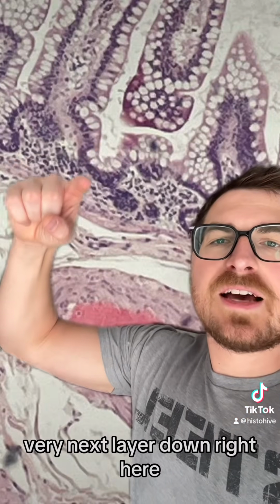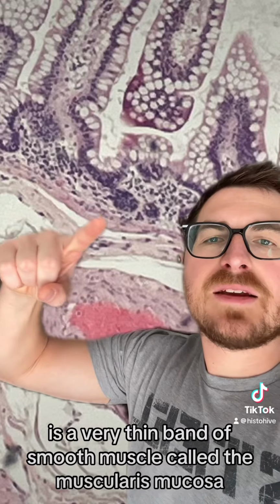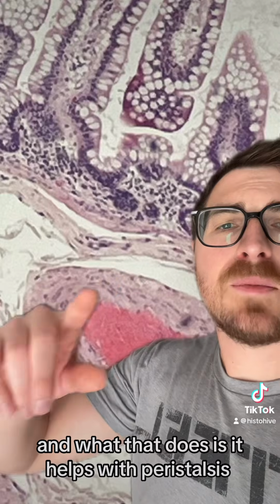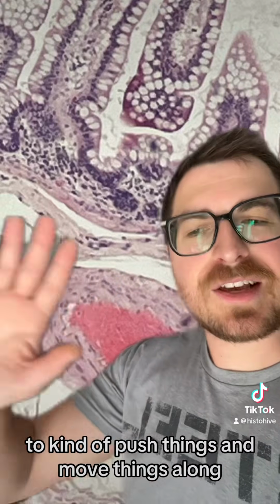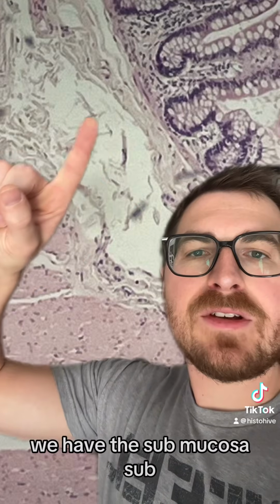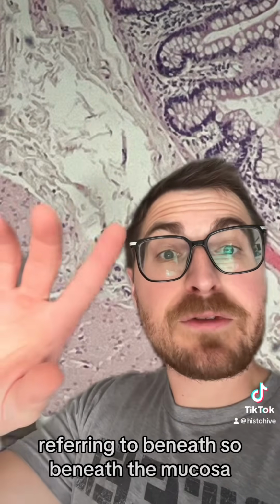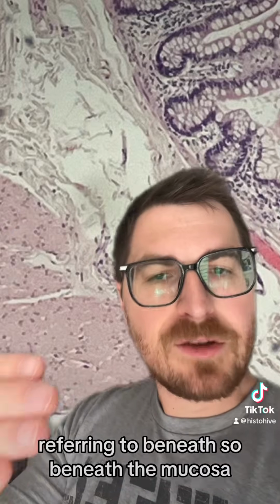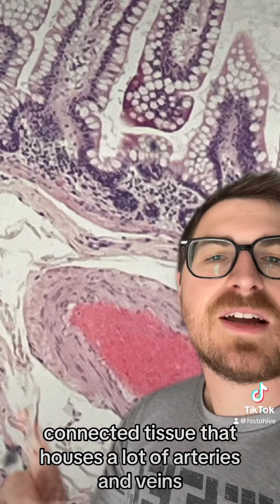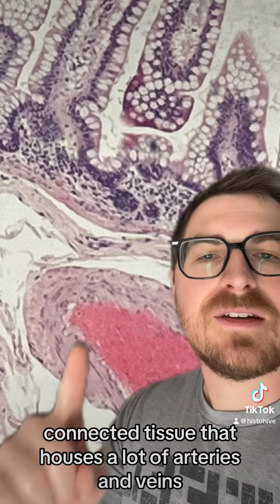The very next layer down, right here, is a very thin band of smooth muscle called the muscularis mucosa. And what that does is it helps with peristalsis to kind of push things and move things along. Underneath the muscularis mucosa, we have the submucosa. Sub referring to beneath, so beneath the mucosa. And the submucosa is composed of loose connective tissue that houses a lot of arteries and veins.